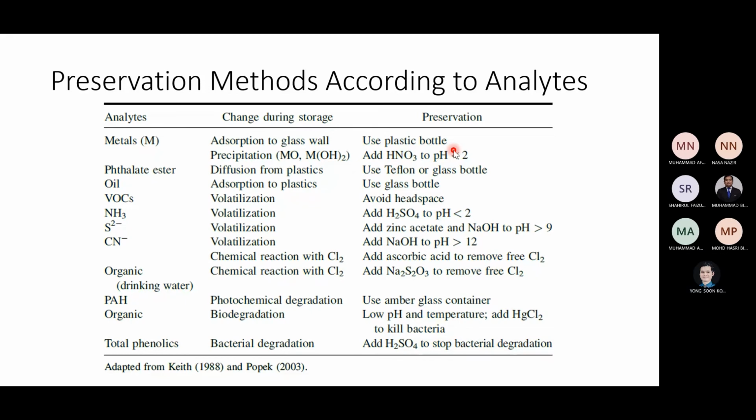And one more reason, plastic is very light. Glass is very heavy and breaks very easily. So that's why plastic is very much preferred over glass bottles.